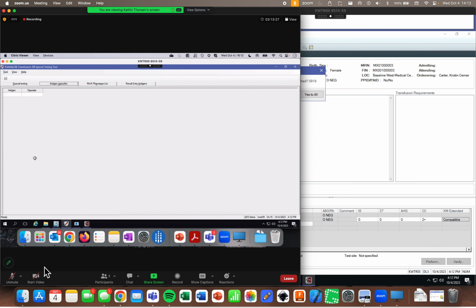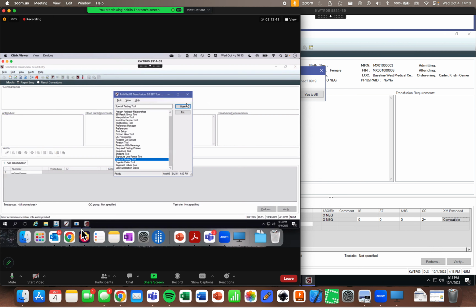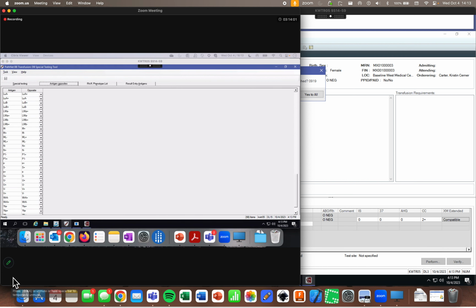I don't think I need to. Well, this one is kind of obnoxious sometimes. I've noticed that sometimes you gotta close out the result entry and then open it again. Yeah, that might do it. It's working. Okay, here we go. This particular code set also is a little bit slow to actually cache the code set out to the code cache server. So sometimes it is a little pokey. But sounds like we got it working. Yay!